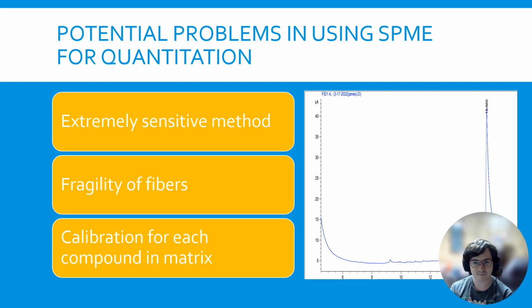And then another thing we have to worry about is the fragility of the fibers. These fibers are incredibly fragile and incredibly expensive. This semester, so this is spring of 2023, I bought a pack of fibers for $627, and it only included 3. These fibers are quite delicate and need to be handled carefully, and that's not ideal. But they're not going to break when they're used correctly.